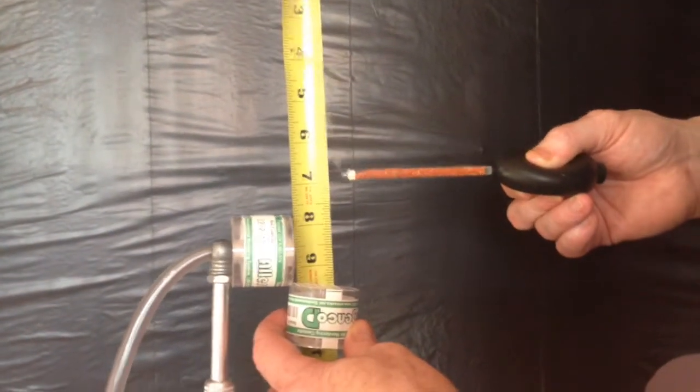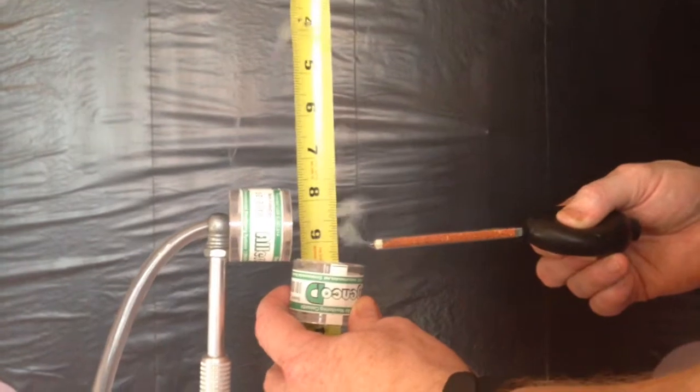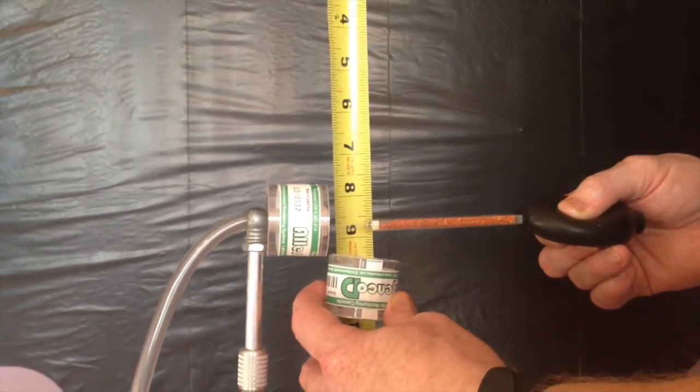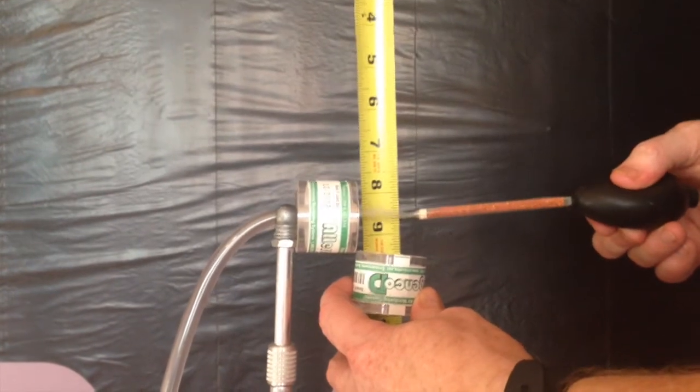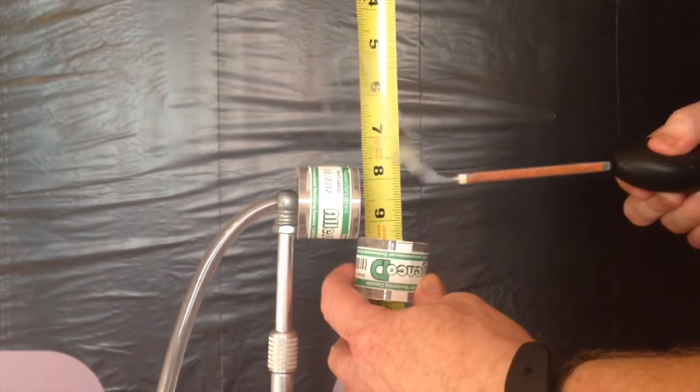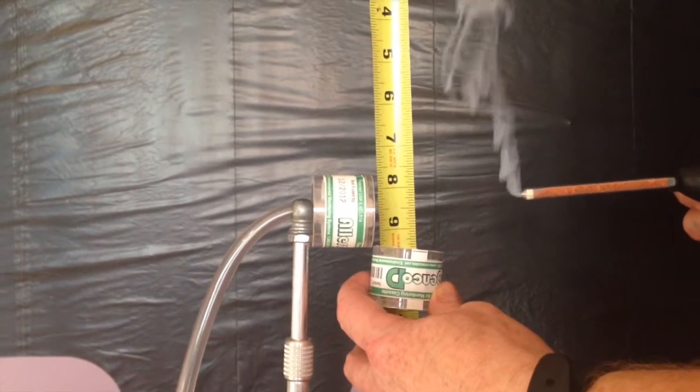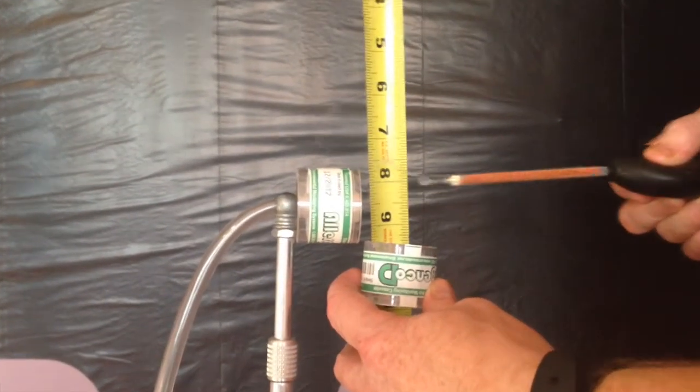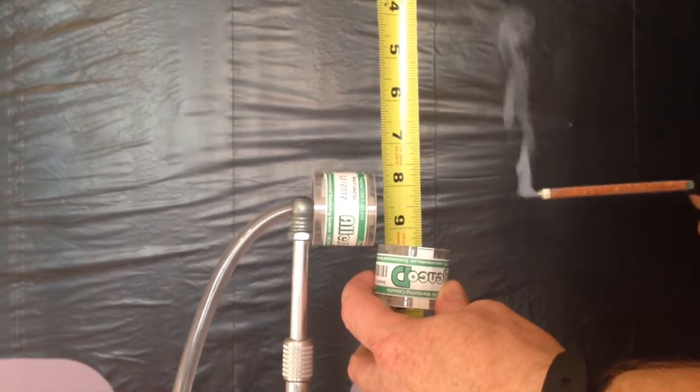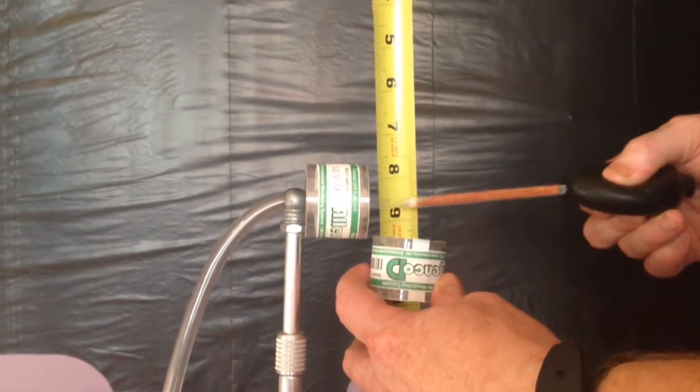The smallest conidia or spore measured is a species of Aspergillus at 1.8 micrometers. The larger the spore, the faster it settles. Look how small the capture zone is - it's no bigger than the cassette itself.